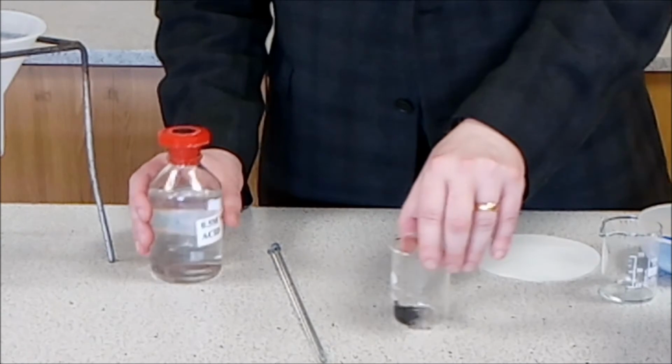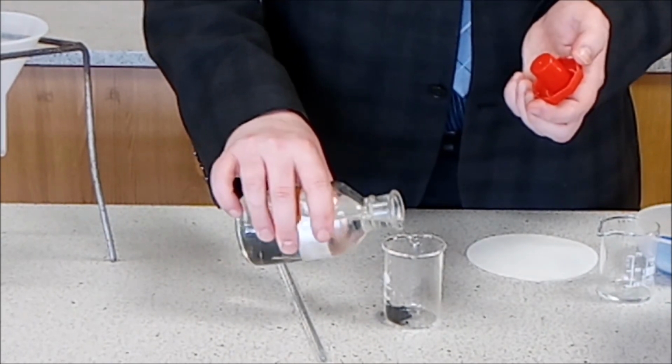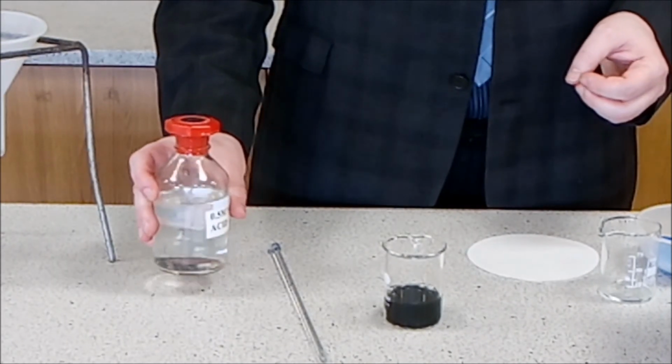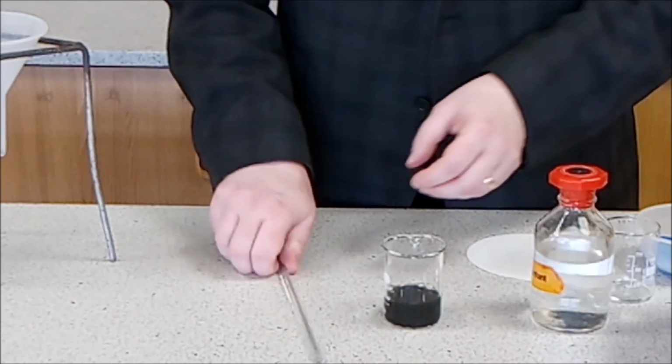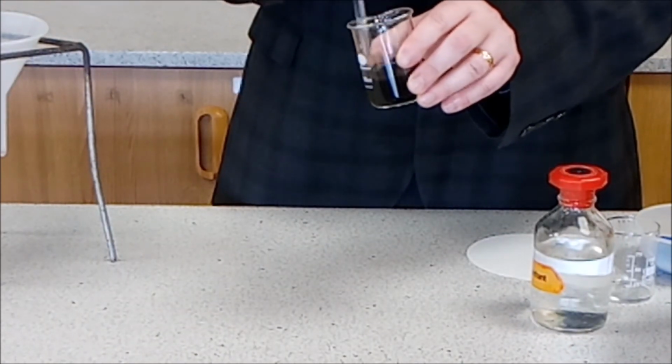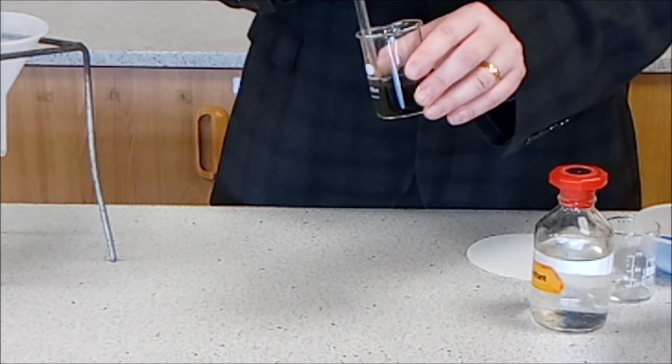You will then pour a certain amount of sulfuric acid in, and you will stir it for around 3 to 5 minutes. The longer you stir it for, the better your results will be, because the more of the copper oxide will actually react with the sulphuric acid to make copper sulphate.